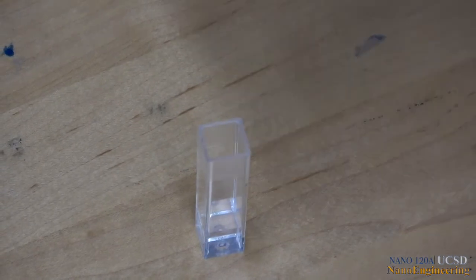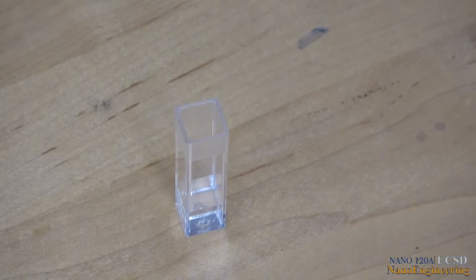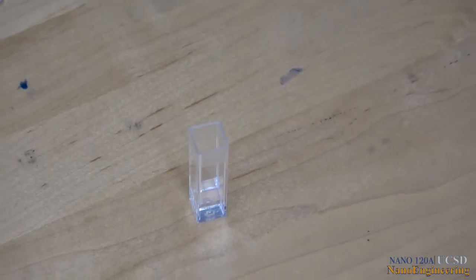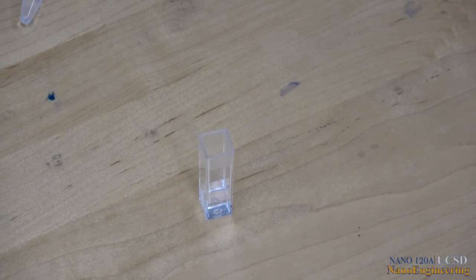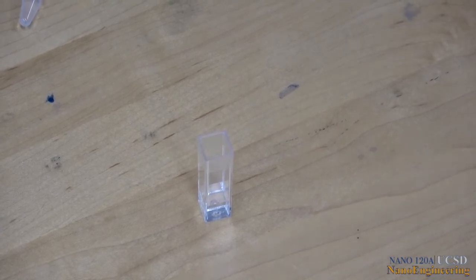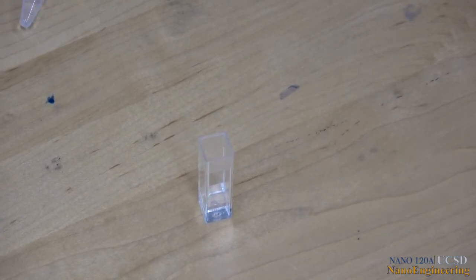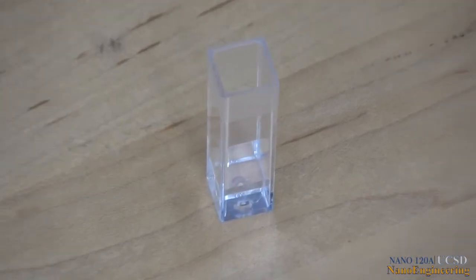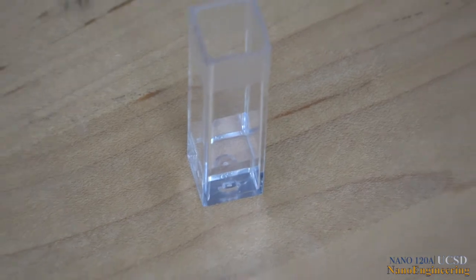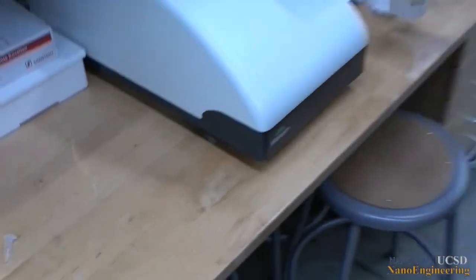OK, so we've prepared a sample for the system. These are polystyrene latex beads, so they should be pretty monodispersed, pretty same size, and they also have a pretty well calibrated surface charge. So I can show you the instrument in a little more detail. Not that there's a lot to see.